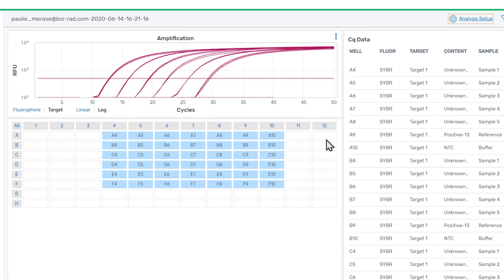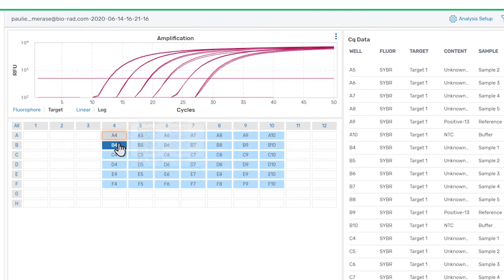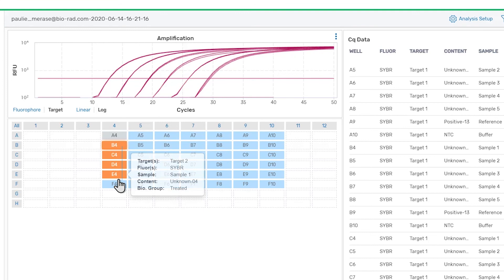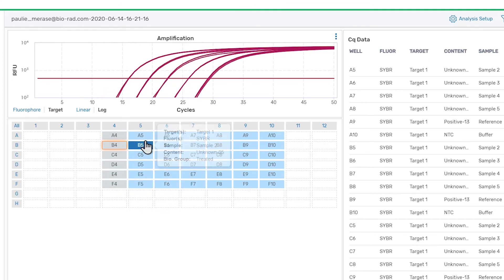Once the thresholds are set appropriately, we can use the well selector below the chart to help us review data from individual wells or groups of wells. All non-empty wells are visible on the amplification chart and data table by default. We can change the visibility of individual wells by clicking on them, by clicking and dragging, or by clicking the plate headers.